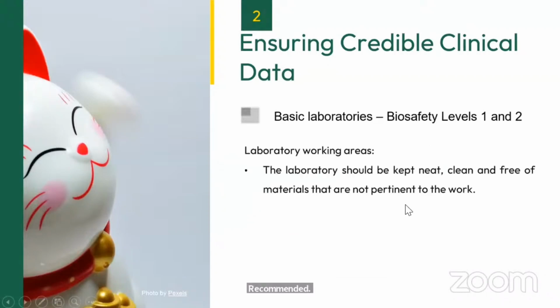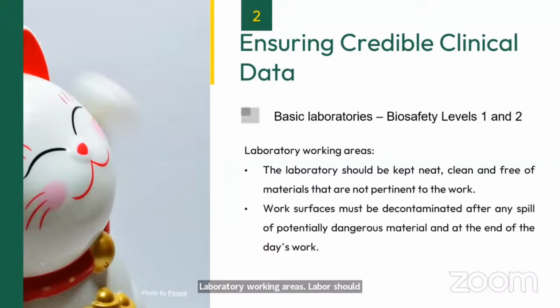The laboratory working areas should be kept neat, clean, and free from materials that are not pertinent to work. So do not keep any unnecessary things in your laboratory working areas.